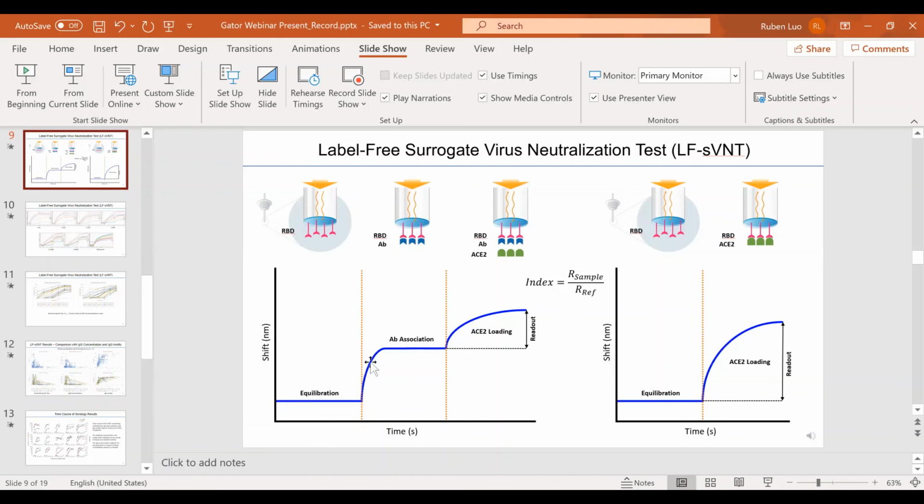However, in this case, we tried, and apparently, in this step, no accurate kinetic measurement could be done because, first, there's a huge number of antibody molecules in many patient specimens. So the mass transport effect is one concern. And second, there are multiple analytes. As I said, all the antibodies against the RBD will bind to the surface. So it's a mixture of all the kinetic information, and we could not extract kinetic constants in this step.